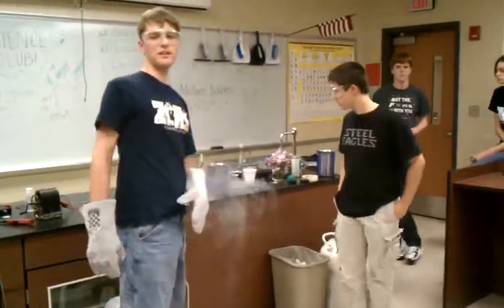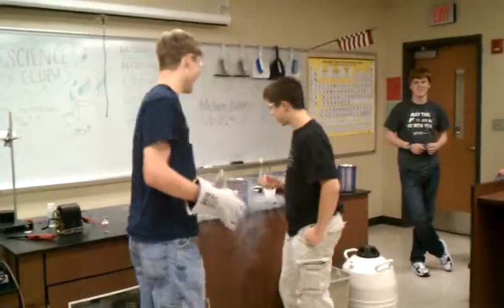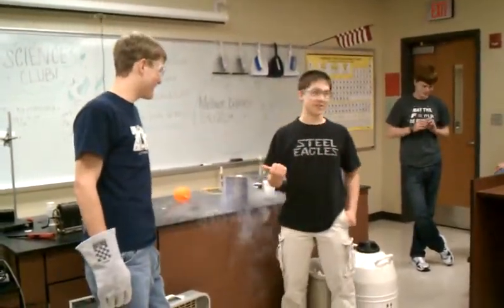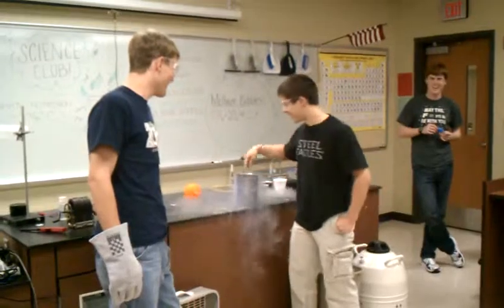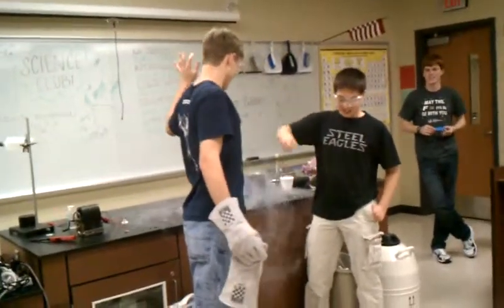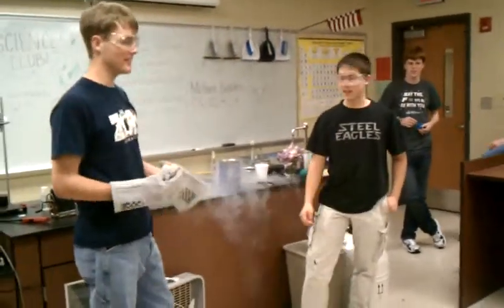Oh, try to put your hand in it. You can. Just flick it out. You're okay. So you may think that you can't actually touch that, else you freeze your body parts, but you can actually throw your hand in it. That's kind of cool. Be braver. Put it in, grab a little bit, flick it out on the floor. There you go. It boils so fast that it really doesn't come in contact with your hand.